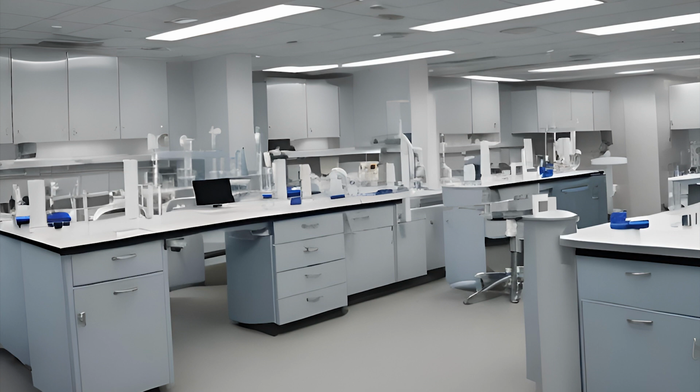It is not unusual for certain specimens to be stored, waiting to be analyzed in a batch or to be sent out altogether. It's the responsibility of each lab to determine their own specimen stability criteria for this process. To ensure the stability of your analytes while held, specific references should be consulted to determine the appropriate handling and storage conditions. That's where your bench supervisors are going to come in. They're going to pull scientific literature to use as a reference where people have already established how long these can be held for. And those references will be used to set your own laboratory's policy.